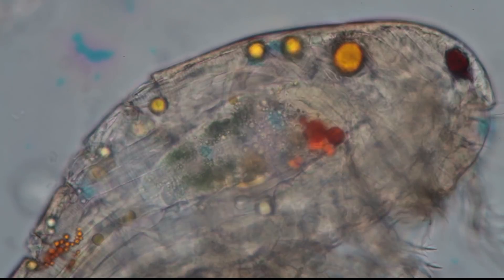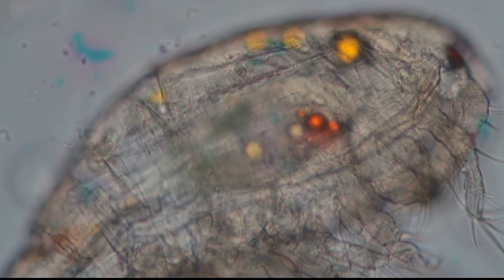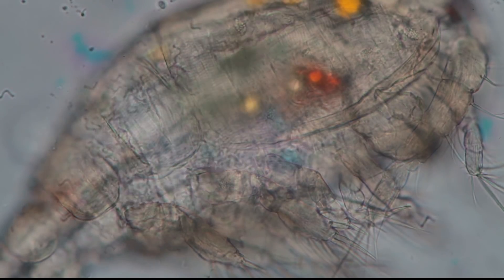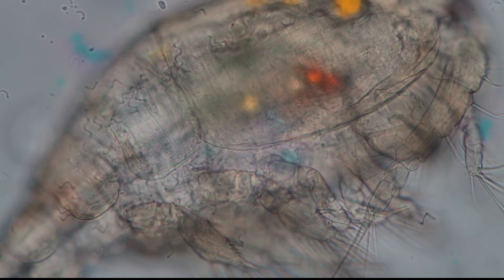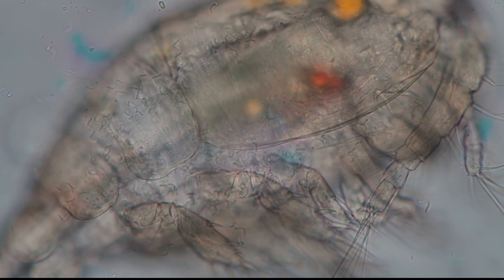As a matter of fact, so many of them that they cannot even move freely. And so that is basically now what I have now in the middle here. That is basically a colony of spirilla here growing directly on this water crab, on this crustacean here. So basically I was able to observe this crustacean, but I think it was already feeling a little bit ill. Because normally what they do is they move in a very vigorous and jerking manner. But now look at all of these spirilla here. Look at all of these spirilla which are colonizing this crustacean. So I think this little crab already started to feel quite ill because of them.